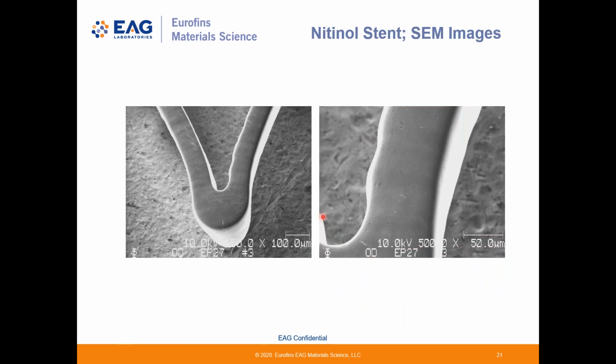Another very important alloy is nitinol, a nickel and titanium containing alloy that's proven to be biocompatible. These days, many implantable devices contain nitinol, including stents, like the one shown here. This is a fairly small device, but Auger is quite able to analyze this type of sample easily. I'd also like to point out that we can analyze not only the inner diameter and outer diameter of these stents, say the top and bottom of this particular segment, but we can also characterize the sidewalls and even the inside of this bend shown here.